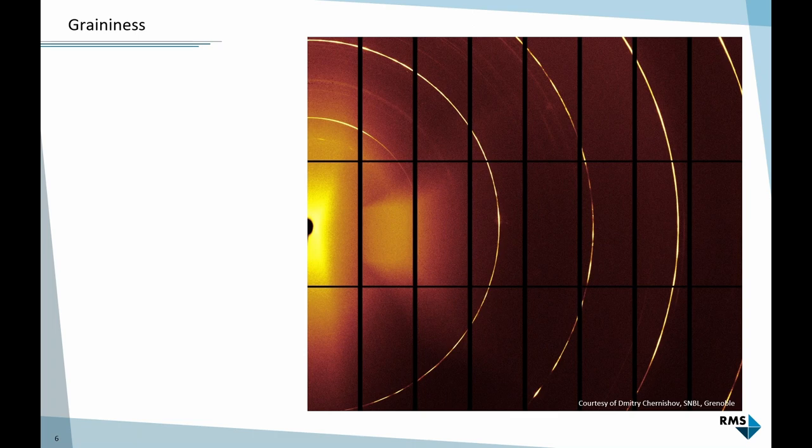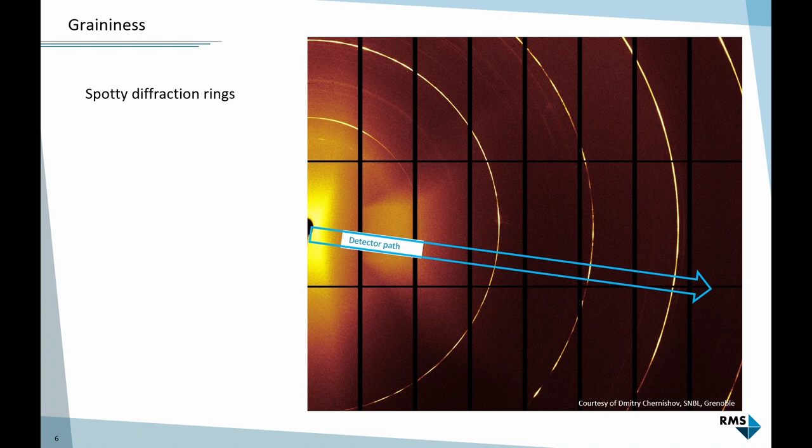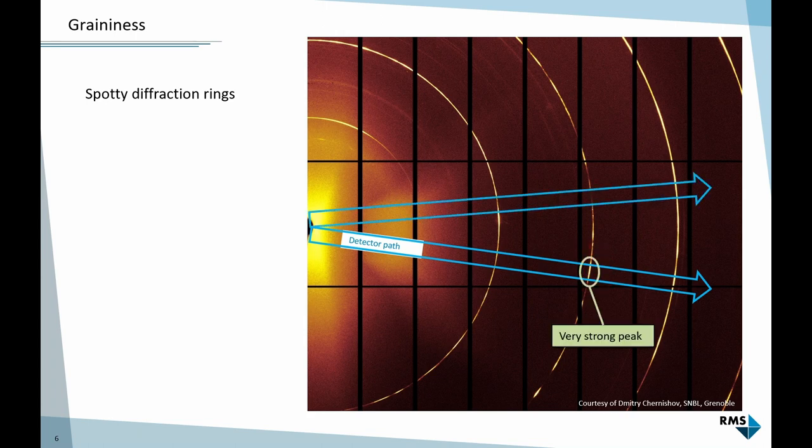On this example from a synchrotron dataset, we can see examples of spotted diffraction rings. This one over here is not smooth at all, this one is much smoother, but this one is spotty. Now imagine our detector scans this path - over here it will register fairly high intensity. But if it scans this path at the same diffraction angle, it would detect hardly any intensity.